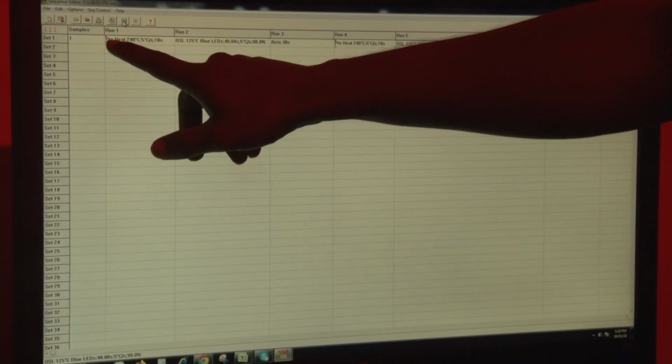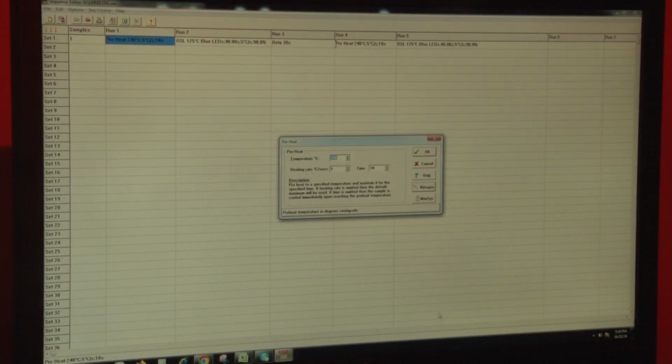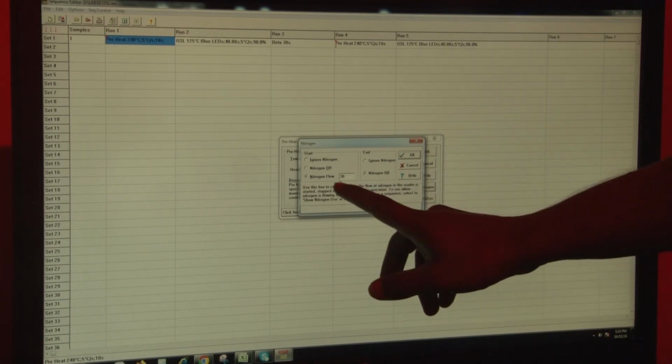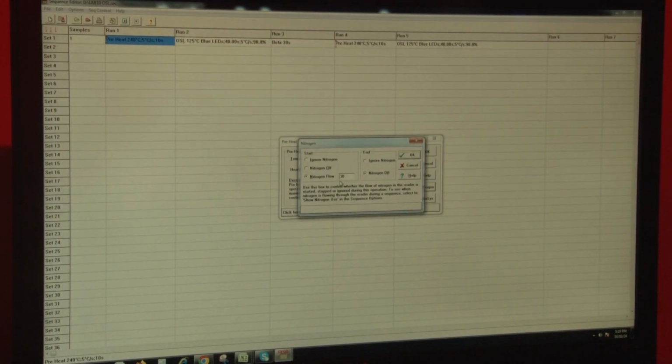In the preheat part, because we are using the 240 degrees Celsius temperature, we have to use the nitrogen. In the instrument, as I discussed, we have the heating plate, so we have to flow the nitrogen to minimize the temperature and to avoid damage to the heating plate.